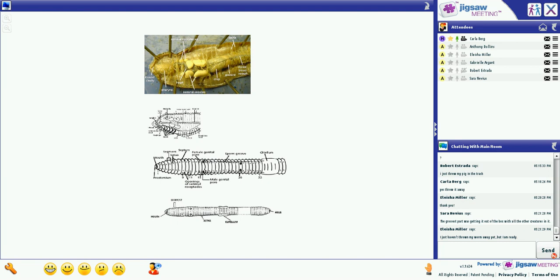All right, awesome. Well, I hope that you enjoyed dissecting. I know for some of you it was not the first time, for some of you it was. It really isn't that bad. It truly is just a minute or two of cutting, followed by some exploring, as I like to tell students. The earthworm is definitely the easiest and simplest dissection we will do.